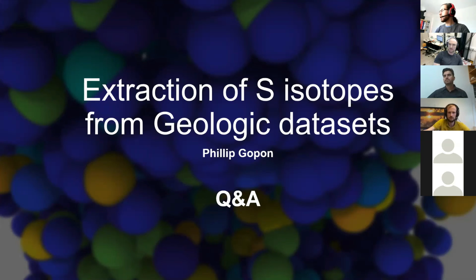Okay. I think we do have a little bit of time. We have a break, but I'm going to be cheeky and ask another question. Put you on the spot while we've got you. What detected multiple hit fraction did you have in these analyses? I can't remember off the top of my head now. It wasn't that small of a number though. We're working a little bit with Cameca. They were starting to do some work for us before COVID, so we haven't managed to get any analyses done yet at Cameca with their instruments. But the multi-hit is something that they're looking at more than we are.